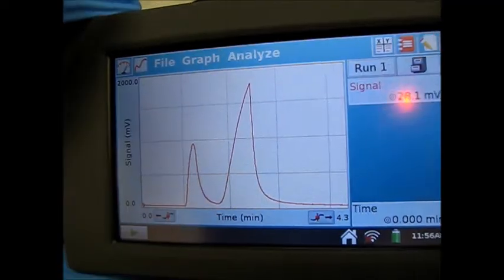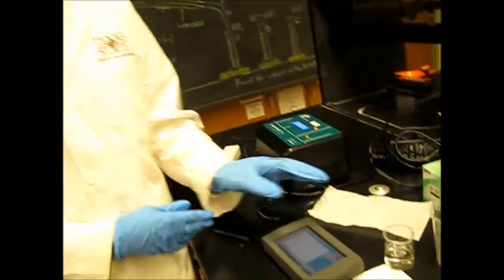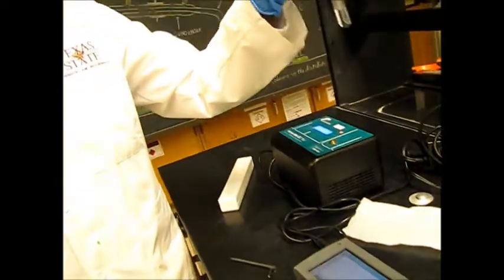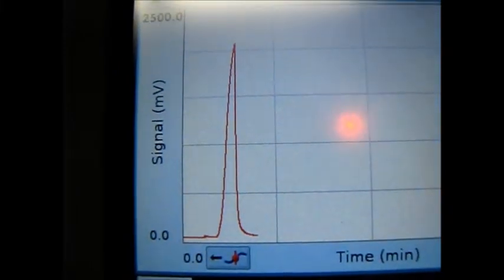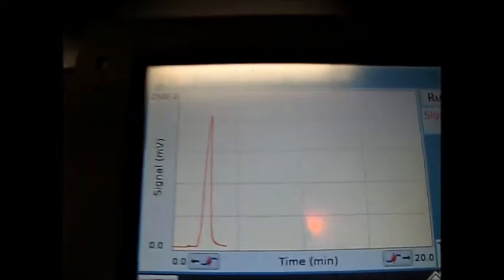Great, so this is the B fraction and we will print and then we will do the same thing for our fraction number C. To rinse and then inject and then collect the print. Okay, great, let's do the printing. So here this is our fraction number A spectra, this is our fraction number B spectra and now here you can see we are running fraction number C, this is C. It's almost done and single peak, very small amount of B. So we will print this as well.